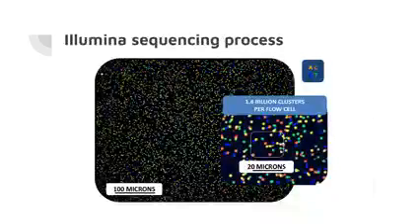So a flow cell ends up looking something like this when you fluoresce them. There is a ton of potential clusters you can have on a flow cell, up to 1.6 billion clusters when you oversaturate it, which is not a good thing. You want to have a bit less than that, so the machine's not overloaded, basically. It can tell which cluster belongs to which. And yeah, this is why we call it high throughput sequencing, because we can sequence so many clusters just in one go.